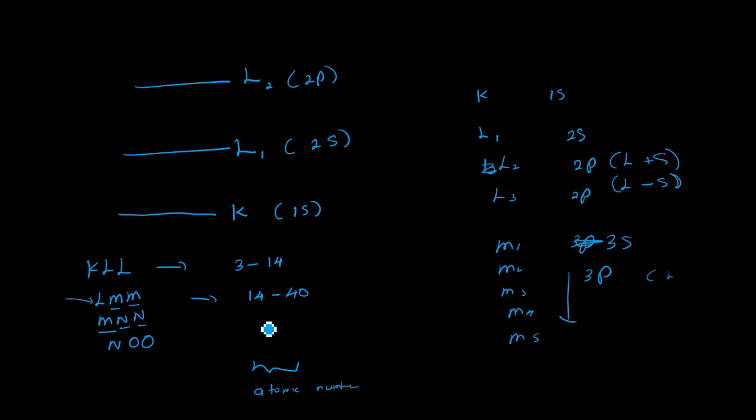So MNN means like 40 to 79 basically. From this state onwards, we have the heavy metals, heavy elements, right? Lead, those heavy elements have high energy levels to have this Auger process. So get the idea, right? So what I want you to do is get the idea about it.